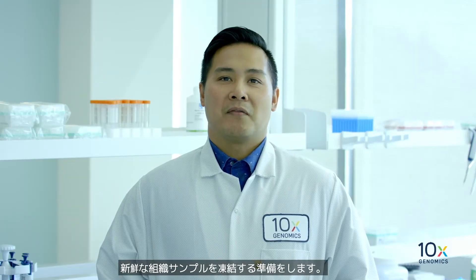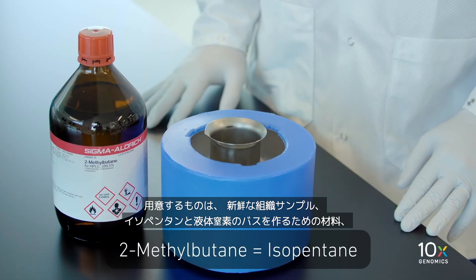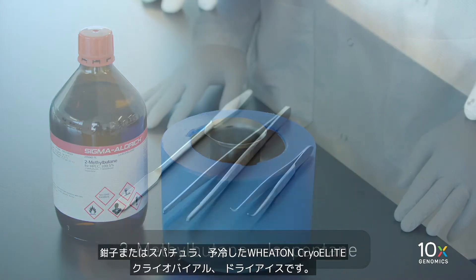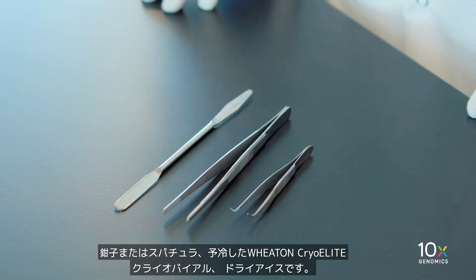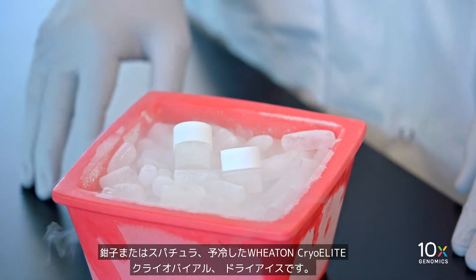We are ready to snap-freeze our fresh tissue sample. We have the fresh tissue, materials to make an isopentane and liquid nitrogen bath, a forcep or spatula, a pre-cooled Wheaton cryo-elite cryovial, and dry ice.